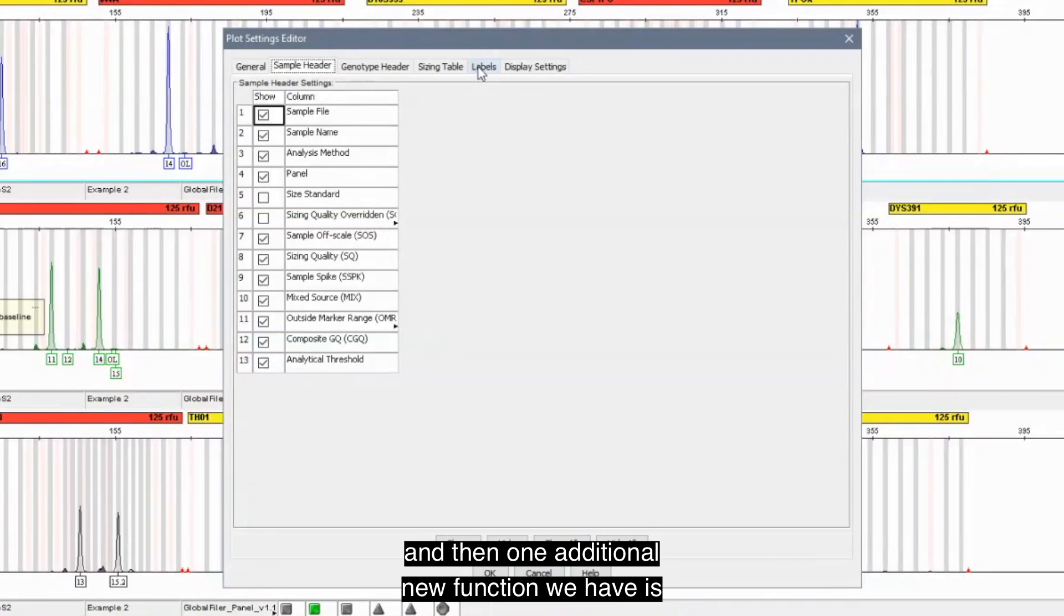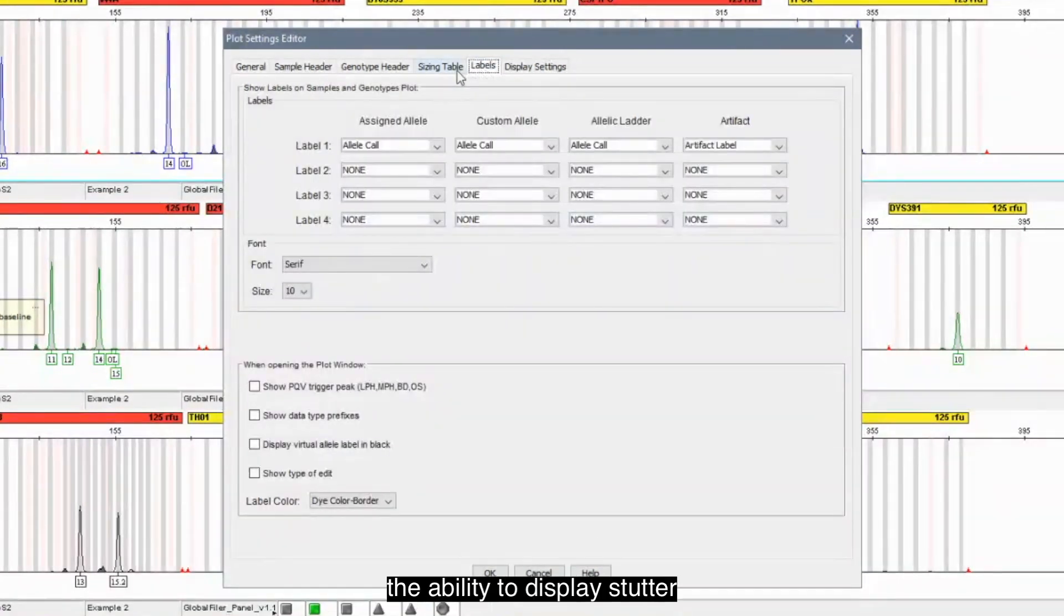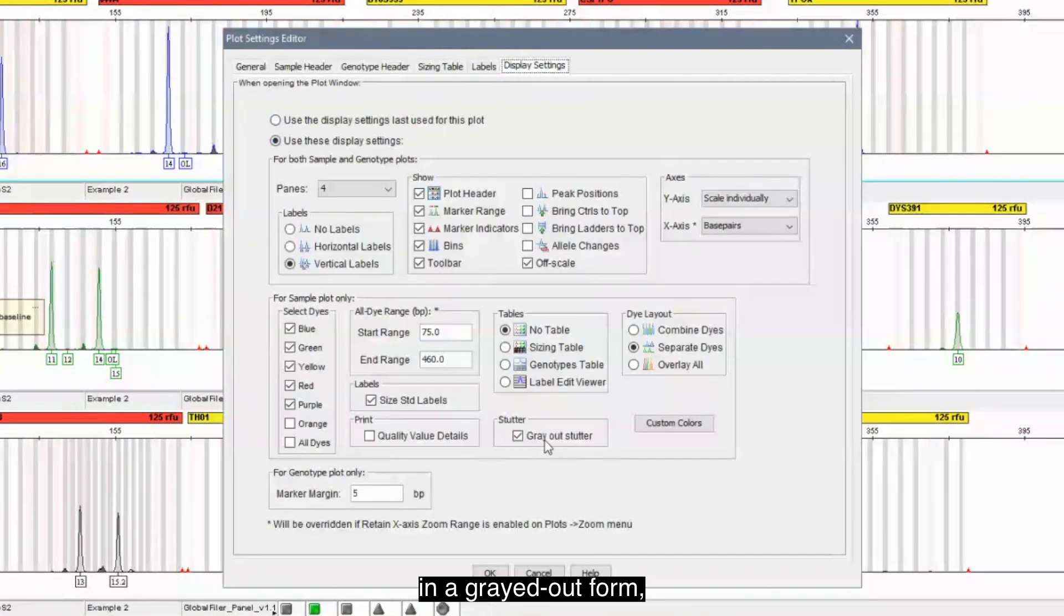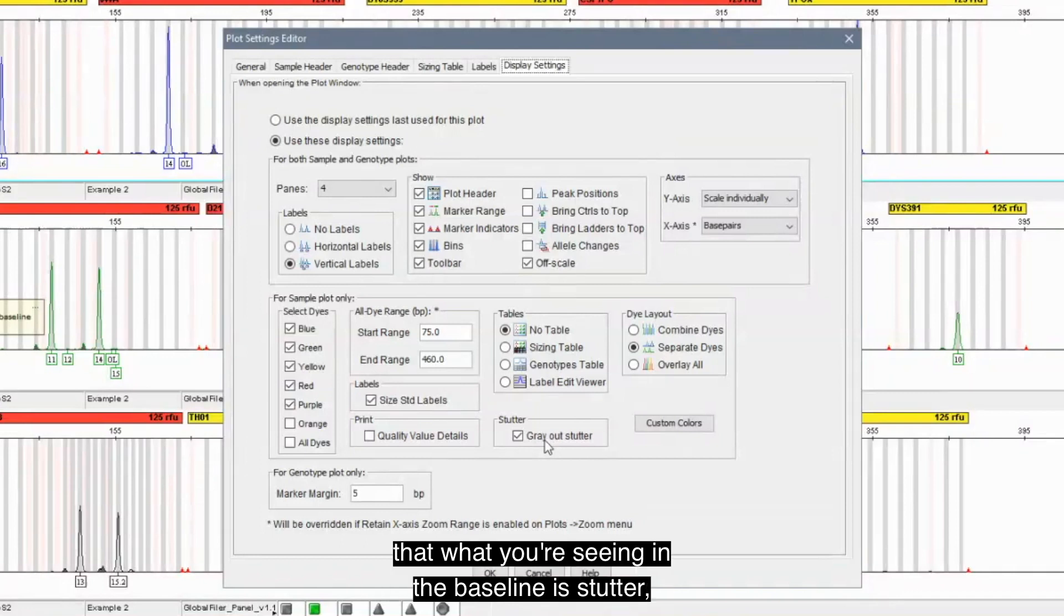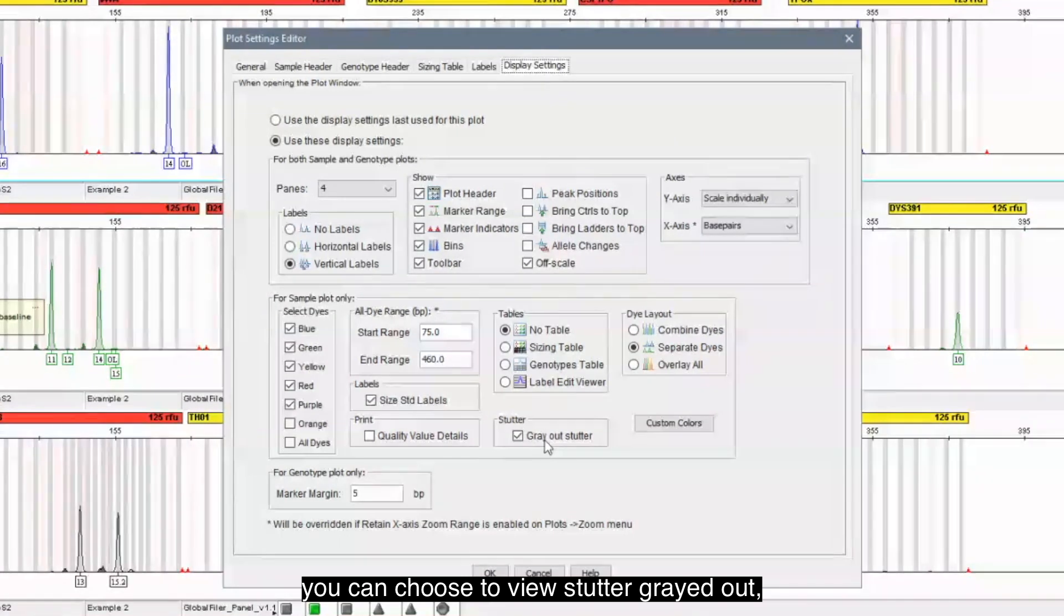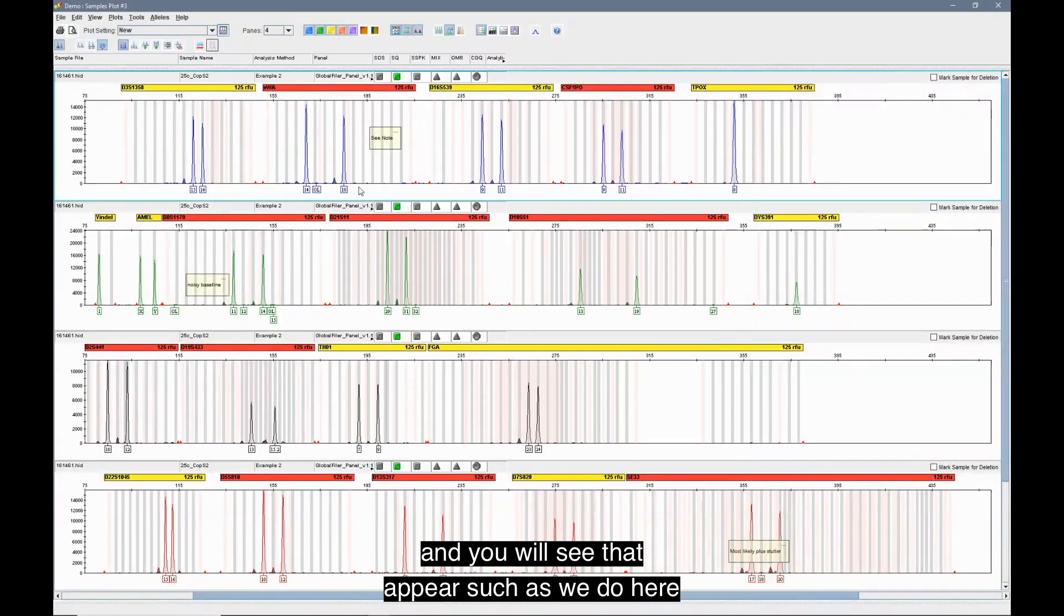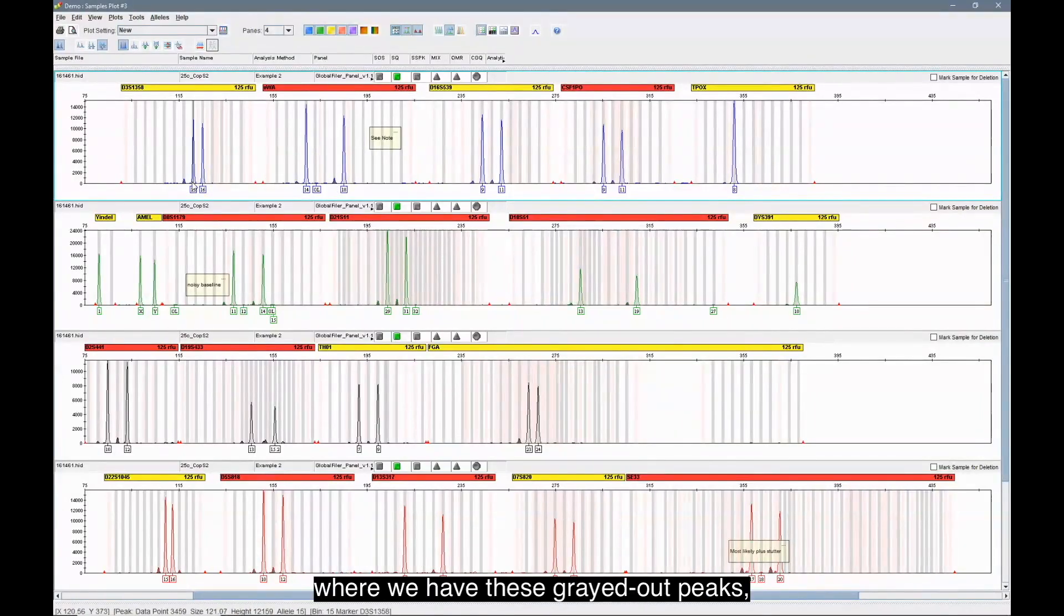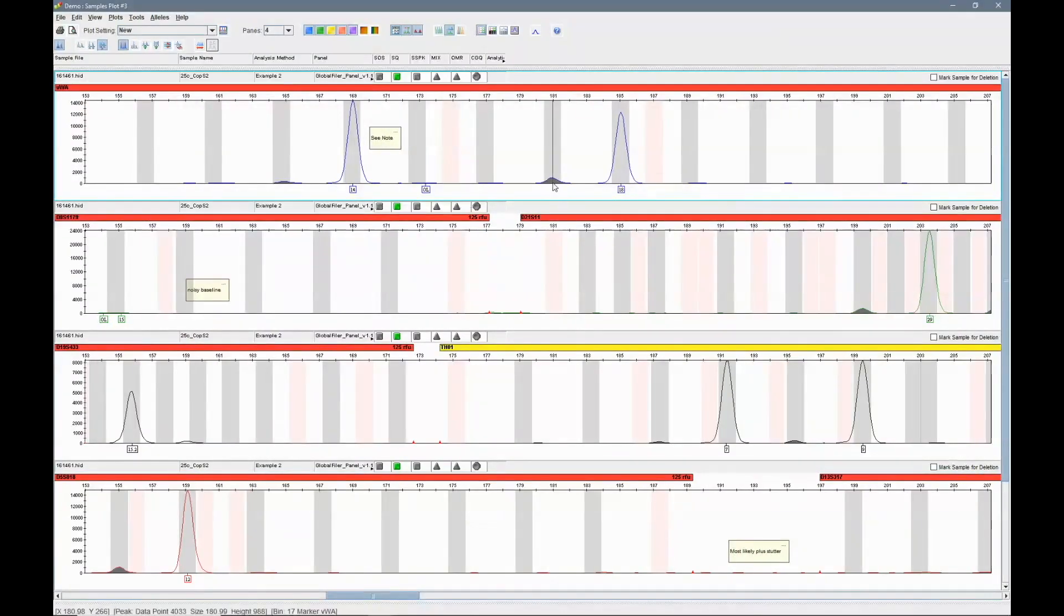All of these are available under plot settings on an optional basis. You can choose to add that analysis method or panel as well as the analytical threshold that you're seeing appear in the marker header bars. And then one additional new function we have is the ability to display stutter in a grayed out form. So if you did want to ensure that what you're seeing in the baseline is stutter, you can choose to view stutter grayed out, and you will see that appear such as we do here where we have these grayed out peaks.